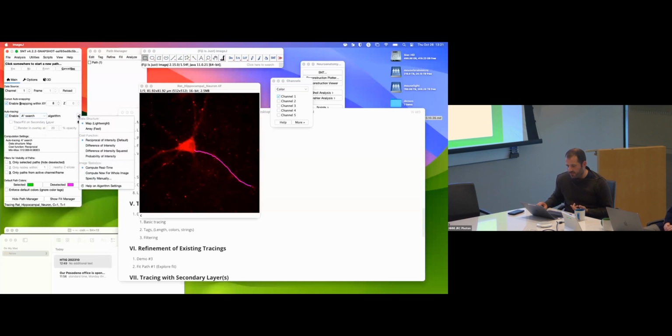And then here you have options to adjust the cost function that you're using for tracing, and you have to read the documentation for this. One of them was taken from Horta, because we were happy with it and it worked with our images when we were doing the ground truth data for the machine learning. Others are taken from the literature, and others are kind of made up, actually. One just kind of made sense once, and then we started using it.